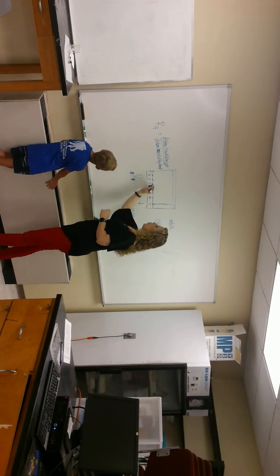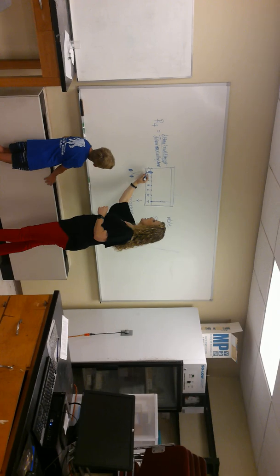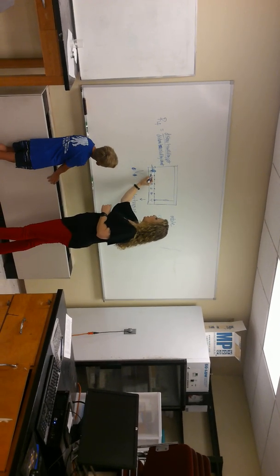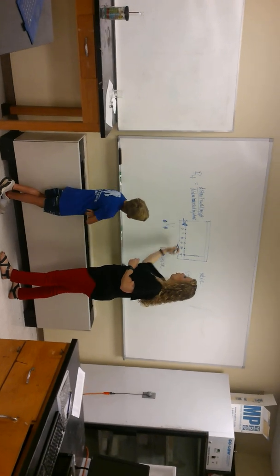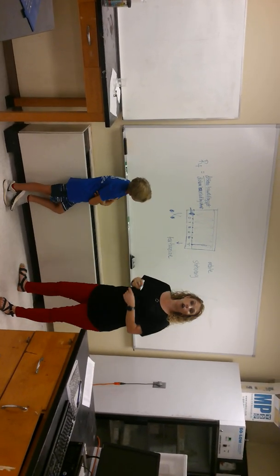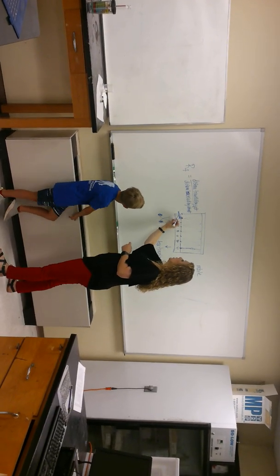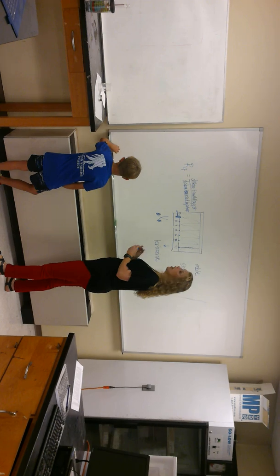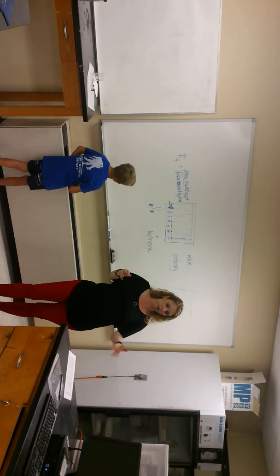That's another reason why you don't want to do a really big dot. If I do a really big dot like this, and I pour my solvent, and my solvent is already right here, then this dye is going to come off in my solvent, and I'm going to see it all across my chromatography paper. So be sure that your solvent in the beaker is below your dot line. Okay, that's very, very important, or else you're going to have a big problem.